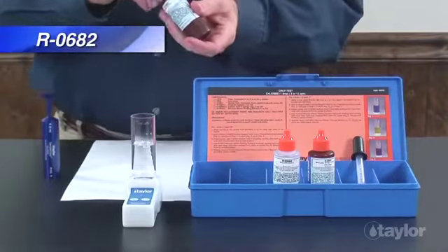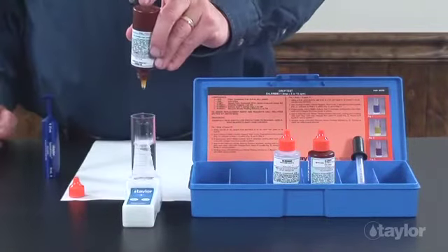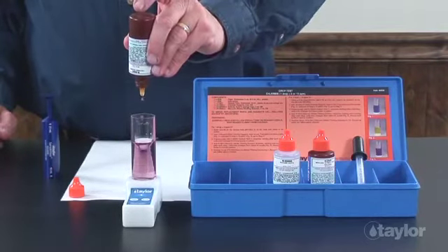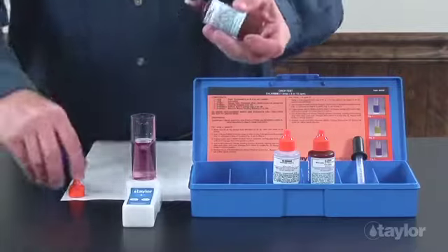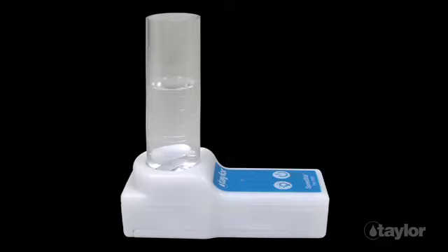Holding the bottle vertically, add 10 drops of reagent 682, chloride reagent, to the sample tube. Swirl to mix. For this demonstration, we are using Taylor's Speedster, which is sold separately, but you can also manually swirl the sample.